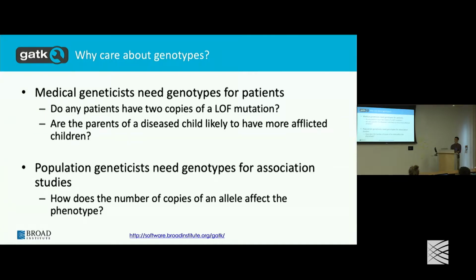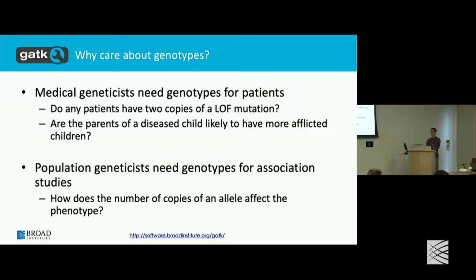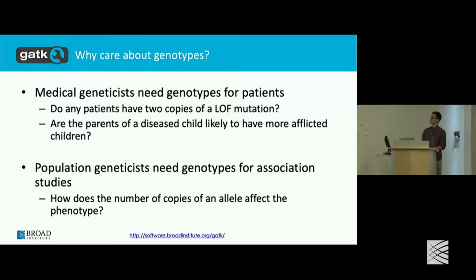There's the allele part, and there's also the count of alleles. By that I mean, is it a homozygous reference site, or is it a heterozygous site? So one copy is the reference, one copy is the non-reference. Or is it homozygous variant, two copies of an allele that does not match the reference? So that's what I mean by genotype.